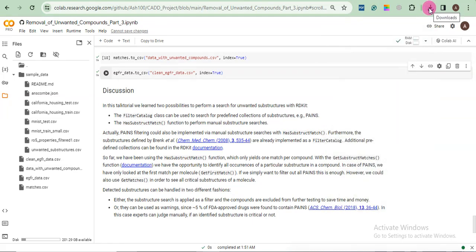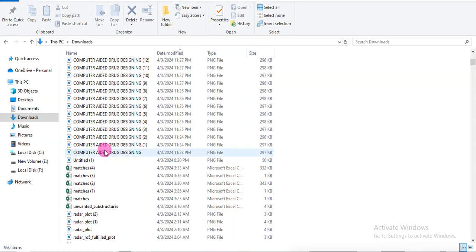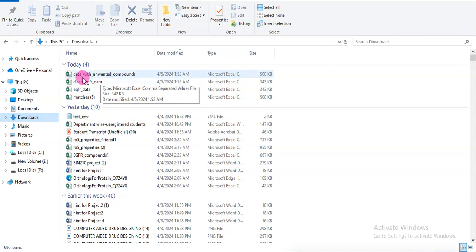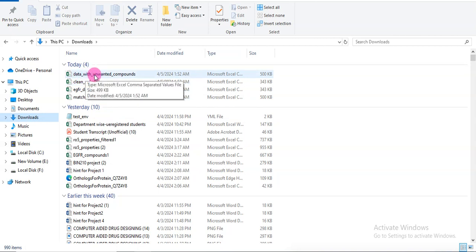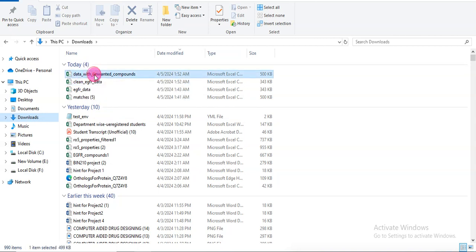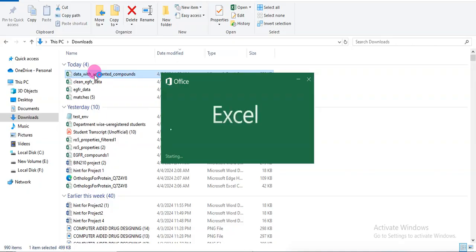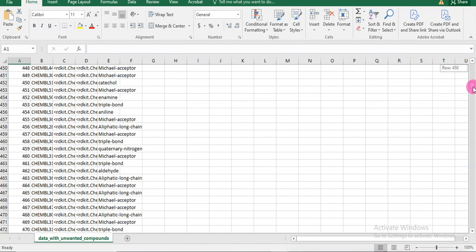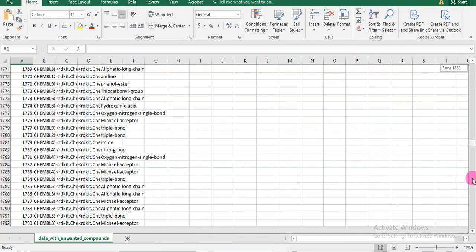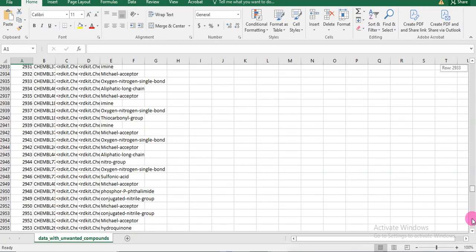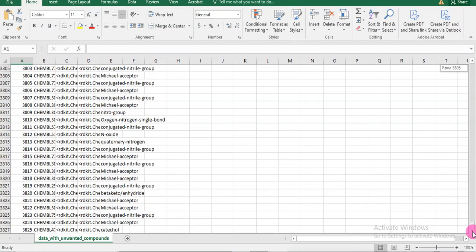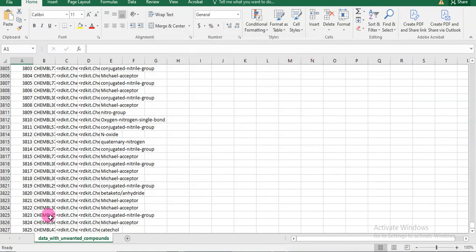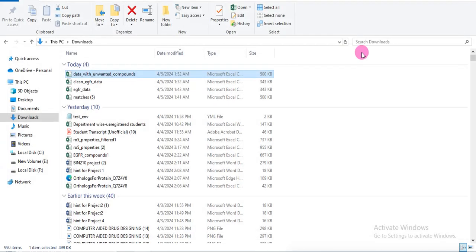First I will open the data with unwanted compounds. These are all those compounds which were extracted because they contain unwanted substructures. 3805, which we already know.